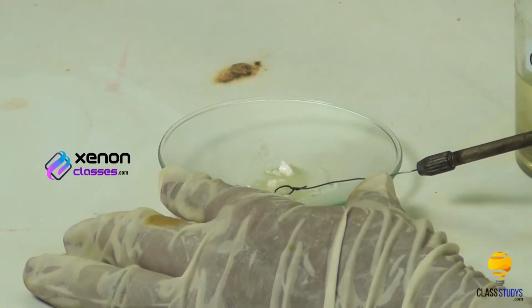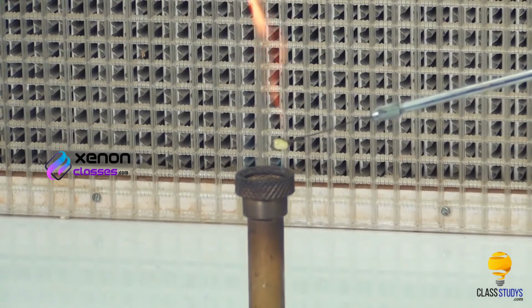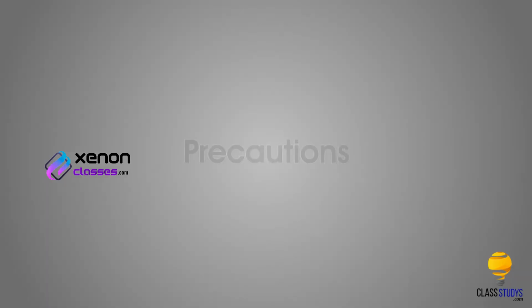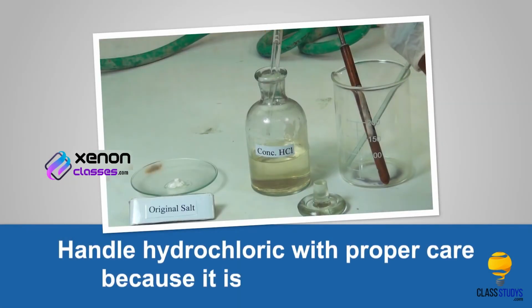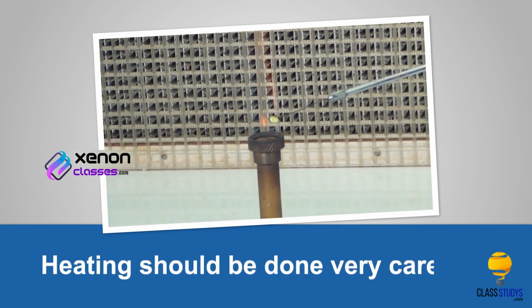Take a small amount of the paste on the platinum wire loop and introduce it into the oxidizing flame of the Bunsen burner. Persistent grassy green flame indicates the presence of barium ions. Precautions: Handle hydrochloric acid with proper care because it is highly corrosive. Heating should be done very carefully.